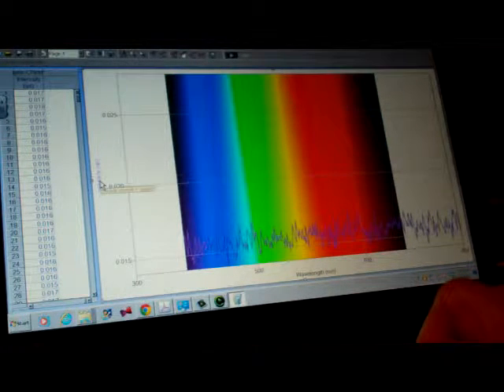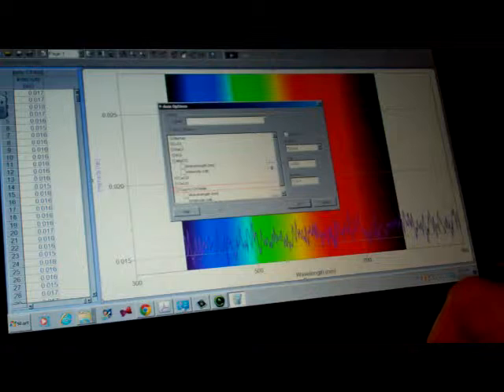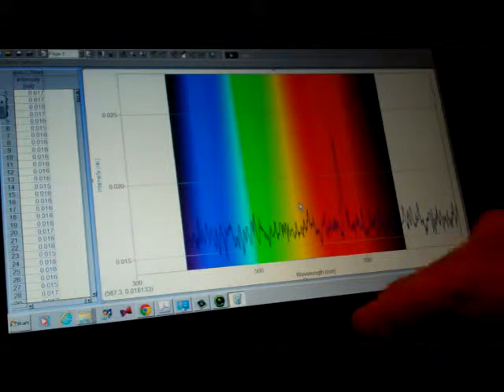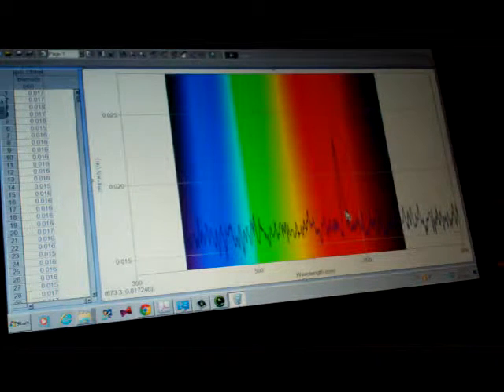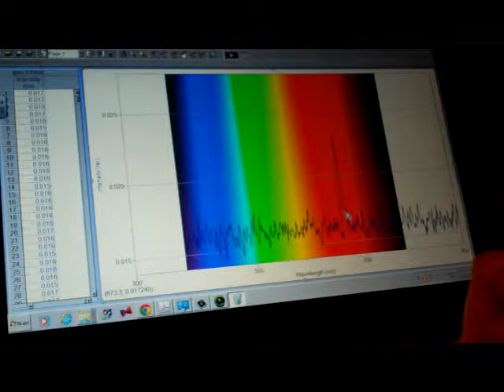Our next, and again, the nice surprise one, just to show you that yes, everything was working well, was our cupric chloride. And again, here's the wavelength, but that's not the one we need for the data, so you will need to make sure you find all the other ones.